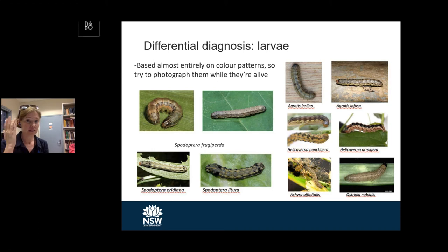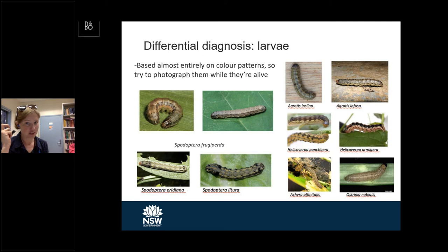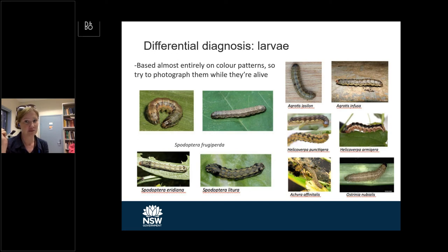Because lepidopteran larvae tend to change color rapidly after they've been killed — they'll shrivel up in ethanol, and if you leave them alive in a jam jar in your car on a hot day they'll turn black and be much harder to identify — we humbly request that you try to take a picture of the larva while it's alive before you kill it. Even if we're going to do a DNA analysis, it's really nice to have a photograph of the color pattern of the live larva.